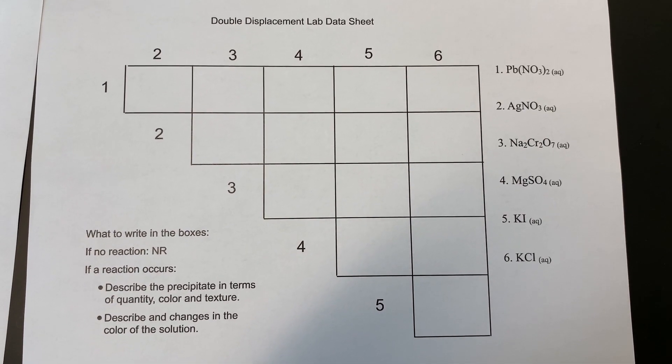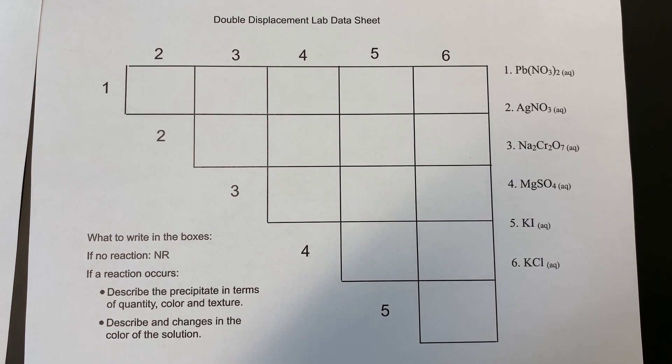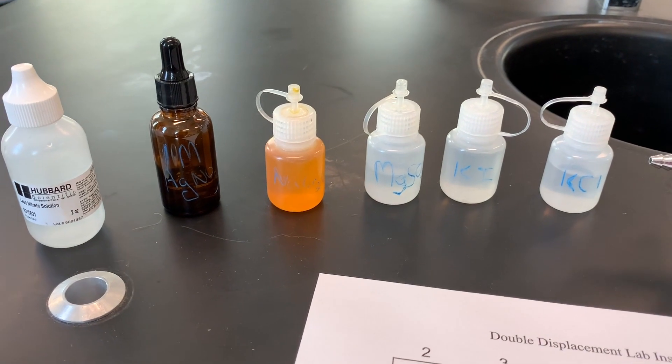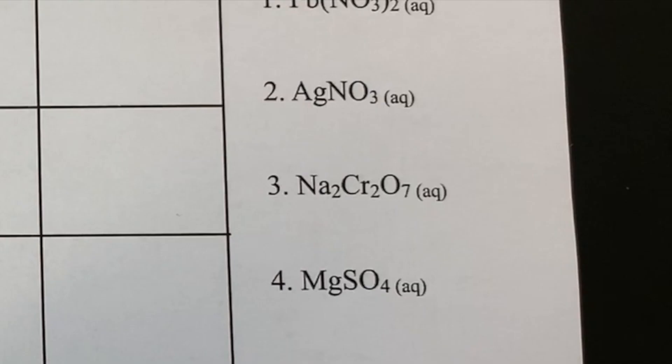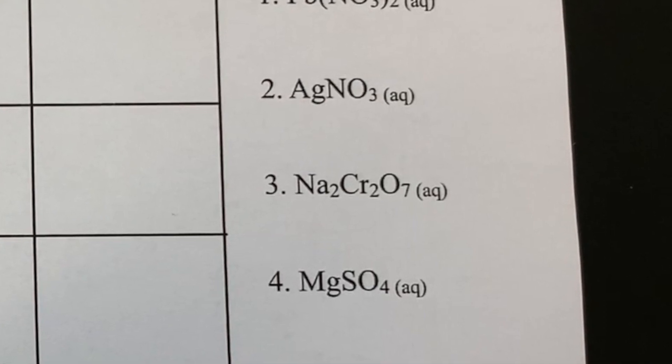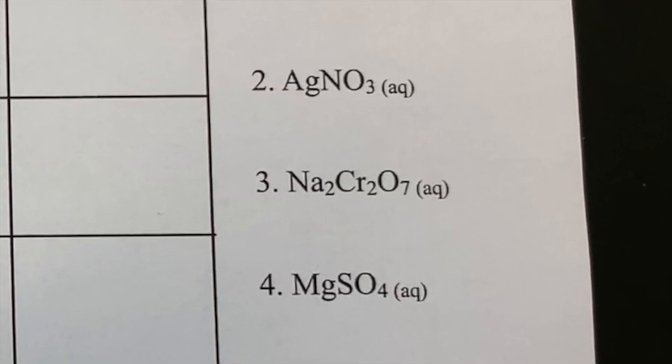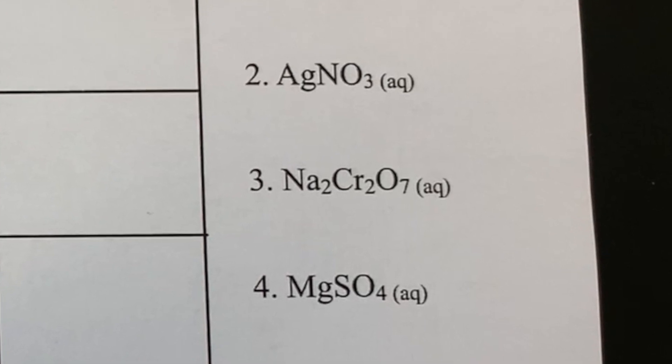And what about the solution? Does that change color in any way? You'll note that all the solutions are colorless except for the sodium dichromate, which is orange. From experience, you know that a salt or sodium chloride solution is colorless. Looking at the formula for sodium dichromate, can you see why it's the dichromate ion that must carry the orange color?